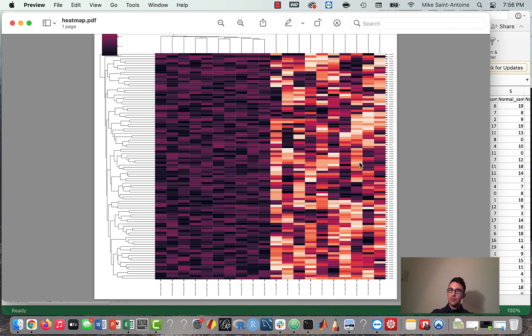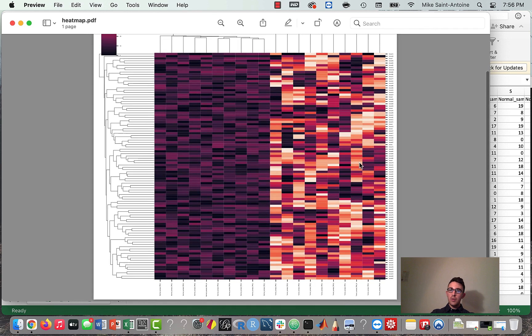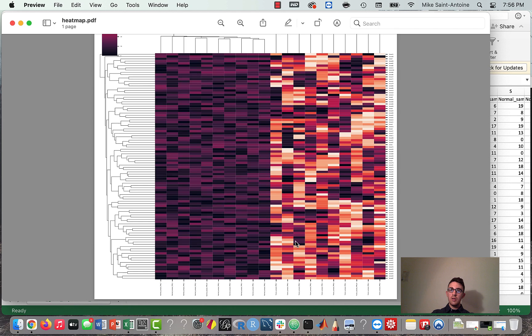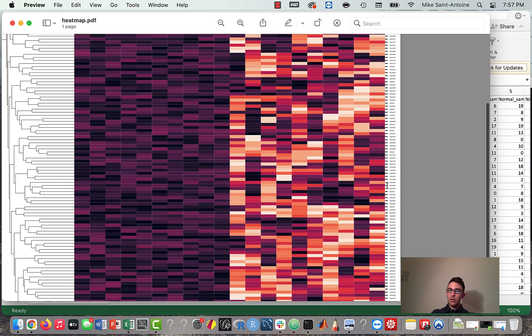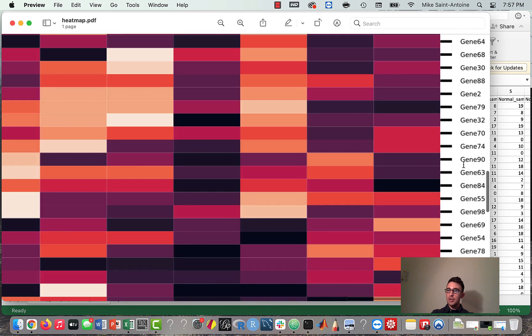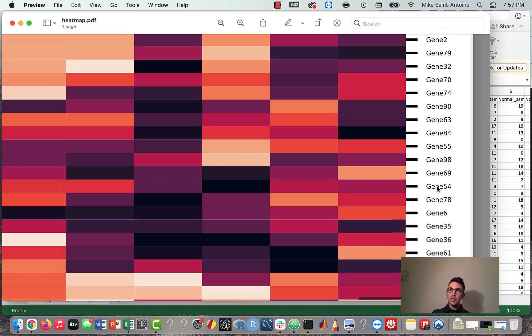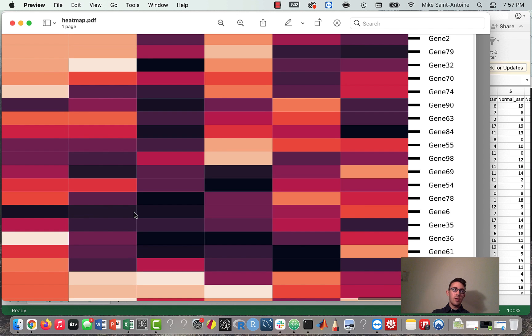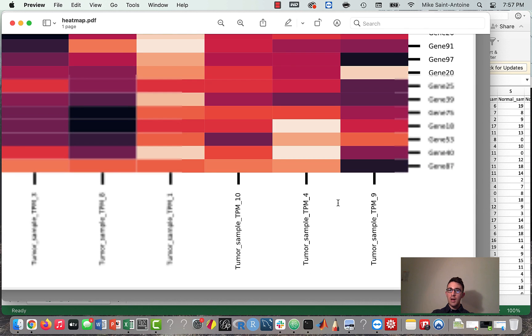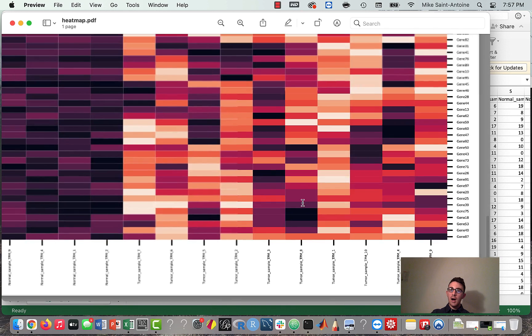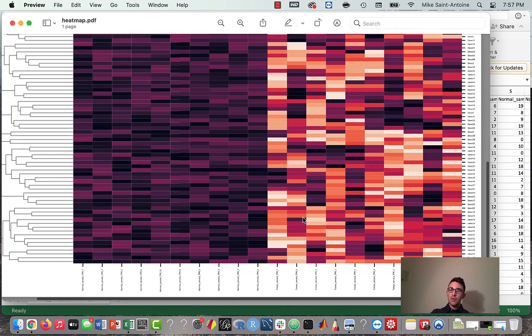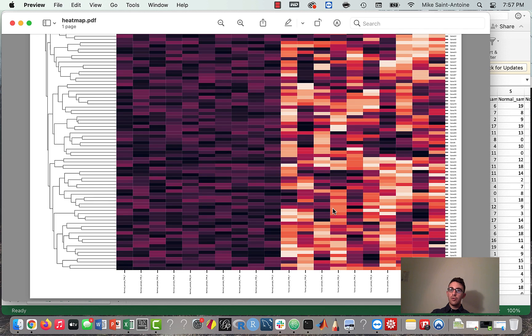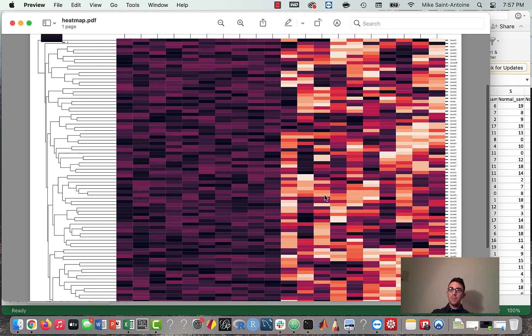If you haven't seen this before, the heat map plot is basically where each one of these squares is showing the expression level for some gene within some sample. On the vertical axis we have a bunch of different genes — the labels of genes — and each row is a bunch of different expression levels for that gene. On the horizontal axis we have the names of the samples, and each column is all of the expression levels for the genes in a sample. So each one of these squares is like a certain gene in a certain sample.